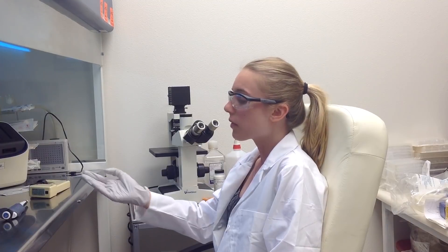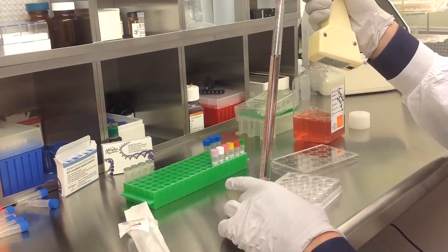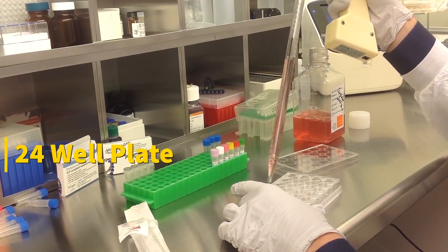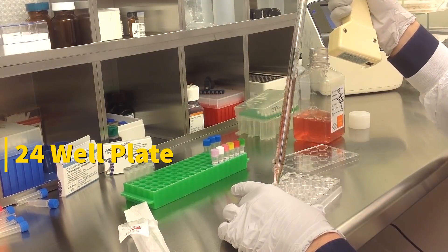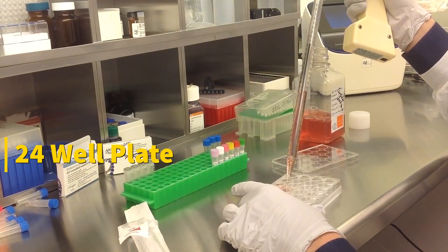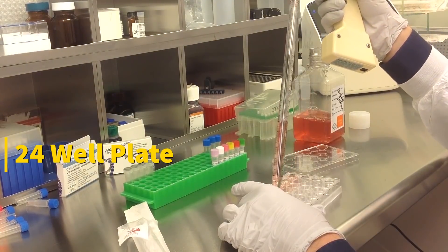Today we will be transfecting HUVEC cells obtained from ATCC. We will be using a transfection kit manufactured by Altigen Biosystems. In this tutorial, we use a 24-well plate. Transfections can be scaled up or down based on plate surface area as described in the corresponding transfection protocol, which can be found at altigen.com.